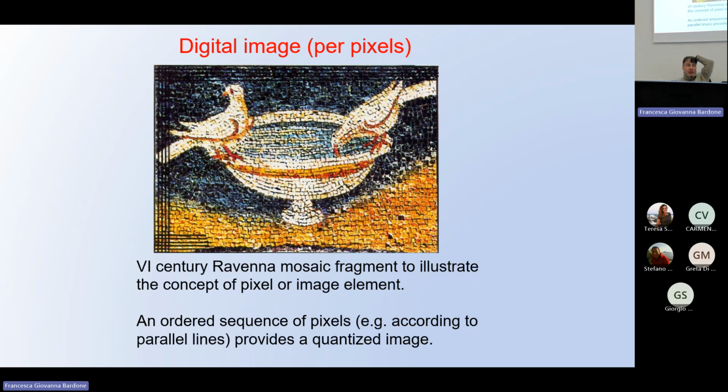But why do we call this instrument scanning? Because the way in which the image is built in the scanning electron microscope uses a scanning beam.